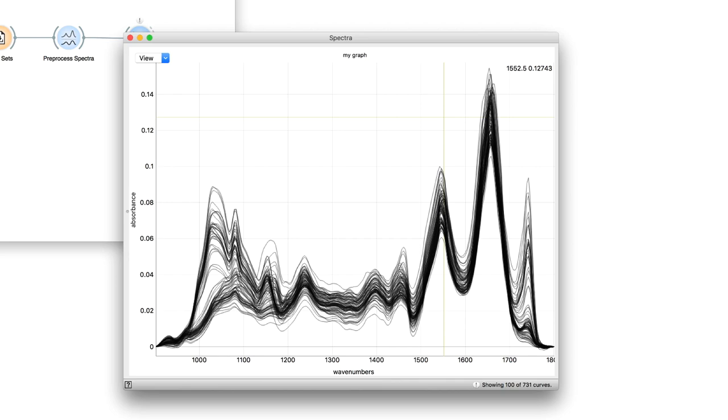Congratulations! This is your first orange graph. We will stop here and let you explore the functionalities of these three orange widgets.